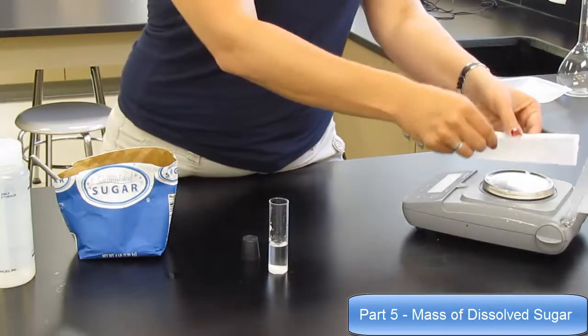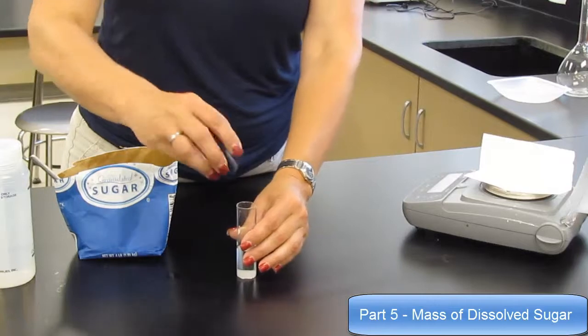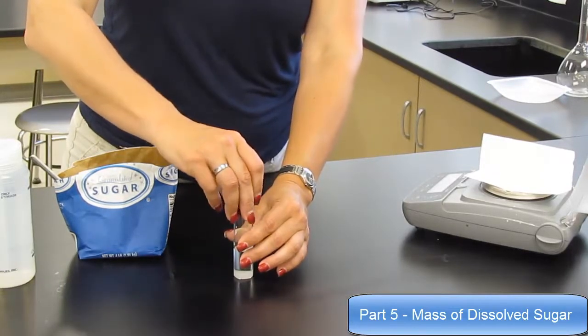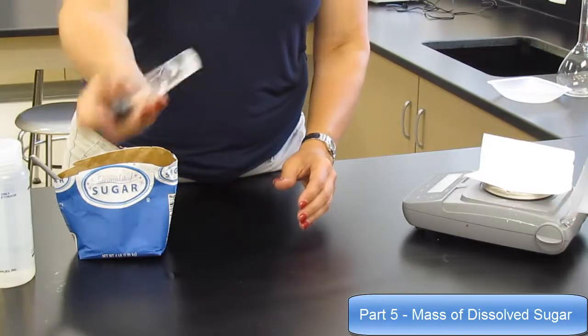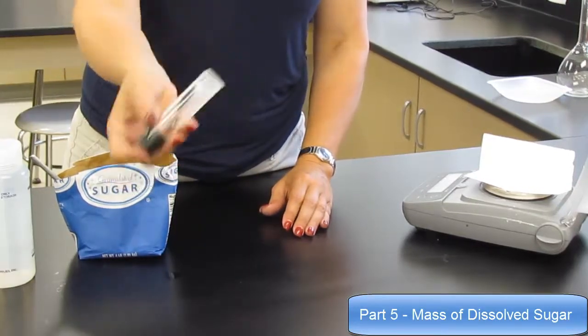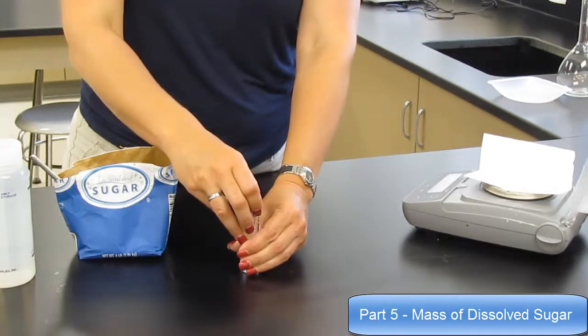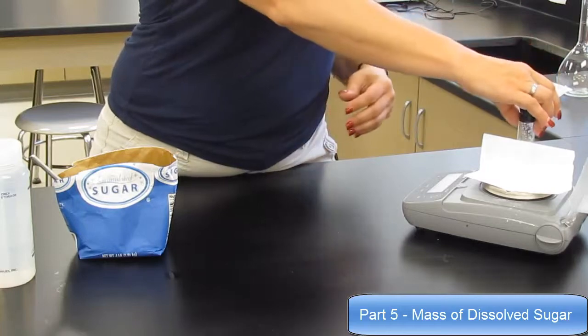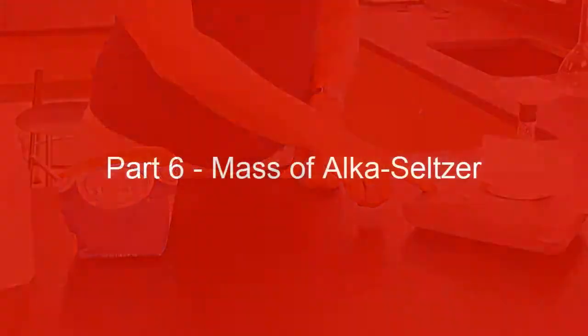That tare paper needs to go back on because we need to mass the tare paper again, along with everything else. Put your stopper on, push it in, and a little quarter turn will be enough to seal it. Keep shaking it until all of that sugar dissolves. Once it all dissolves, place your vial on the balance along with the tare paper and take another reading.